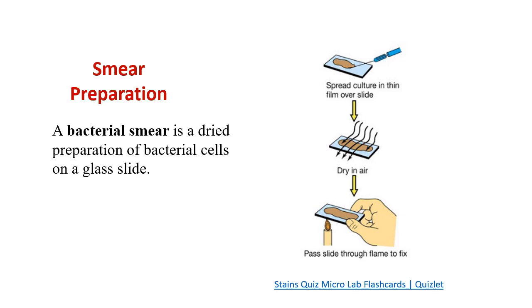It's a very, very basic method. You just need the glass slide, clean it properly, and spread the normal saline or some water if your culture is on plate. And if your culture is liquid, you can put a few drops of liquid culture directly and spread with the help of a loop, and then let it air dry. After that, flame this smear by passing it over the flame at least 4-5 times, so that the organisms get fixed on the slide, and do not run away on staining. In addition, bacteria get killed in this procedure, so it is a safe procedure.